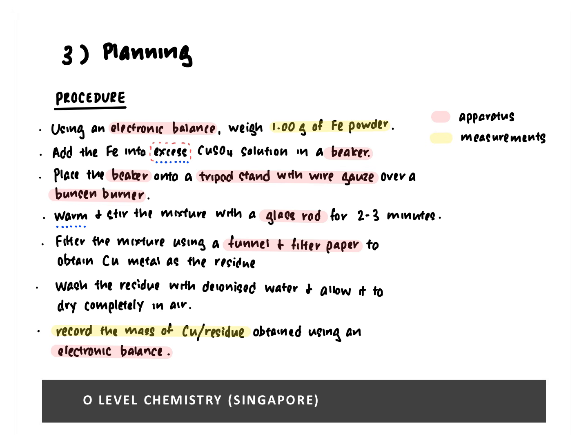Okay, so I don't know whether with that you still need to state that excess copper 2 sulfate solution must be used. The next important key point in your procedure would be, of course, as mentioned, you need to warm, because the question states that the reaction happens when it's warm. Again, I don't know what goes into the mark scheme, but as a teacher, I will look out for that because I've stated explicitly in the question that you need to warm for the reaction to happen.